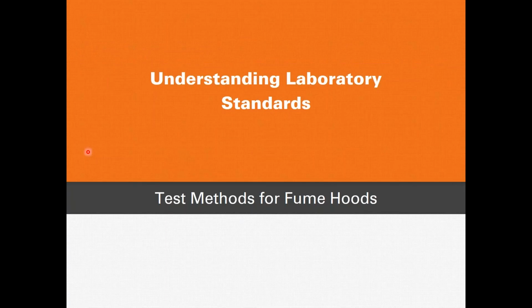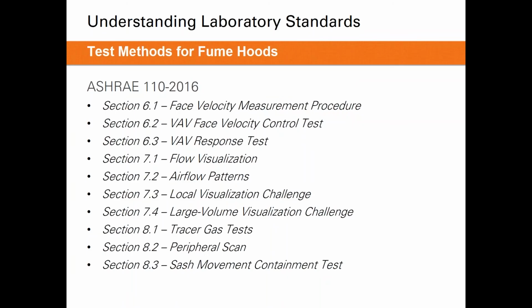So our last topic for today will be test methods for fume hoods. Fume hoods require field certification to ensure that they are performing adequately, and in the following standards, I'll discuss the proper test methods for these fume hoods. The first one that we'll talk about is ASHRAE 110. This is a very expansive test and is very commonly specified. As we go through the different types of standards, we'll also find that ASHRAE 110 is either commonly referenced or used as a template by other standards.